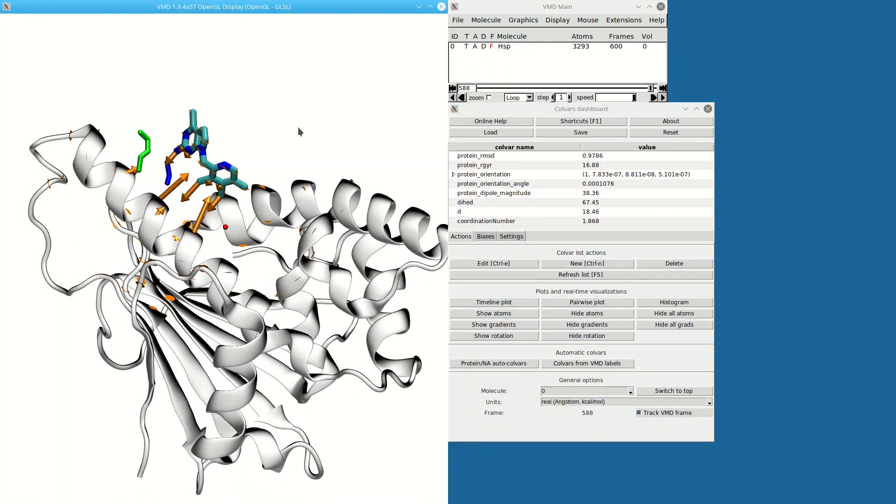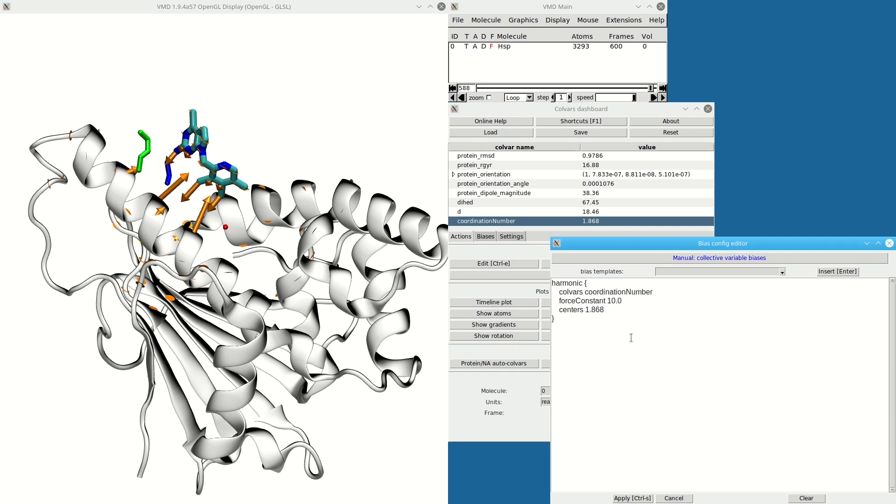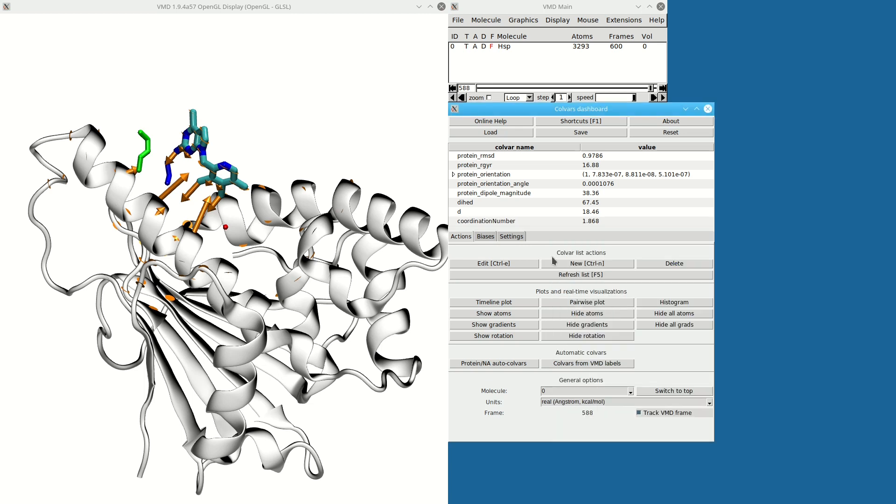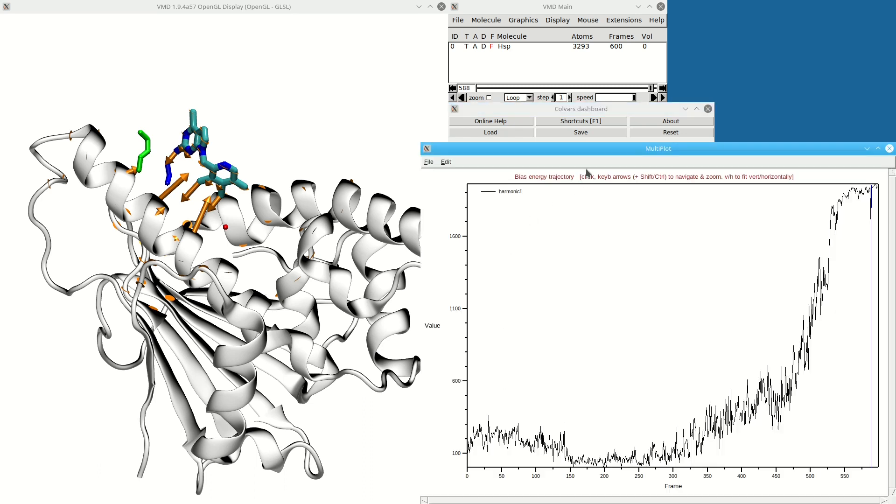So I can see how the Colvars depend on atomic coordinates. Now let's add a biasing potential to this coordination number. Say I want to force it to have a high coordination number to keep it bound—I'm going to use 20 as the reference value. In this Biases tab, I can see the energy of the bias—the energy that would be calculated if this were an actual simulation.